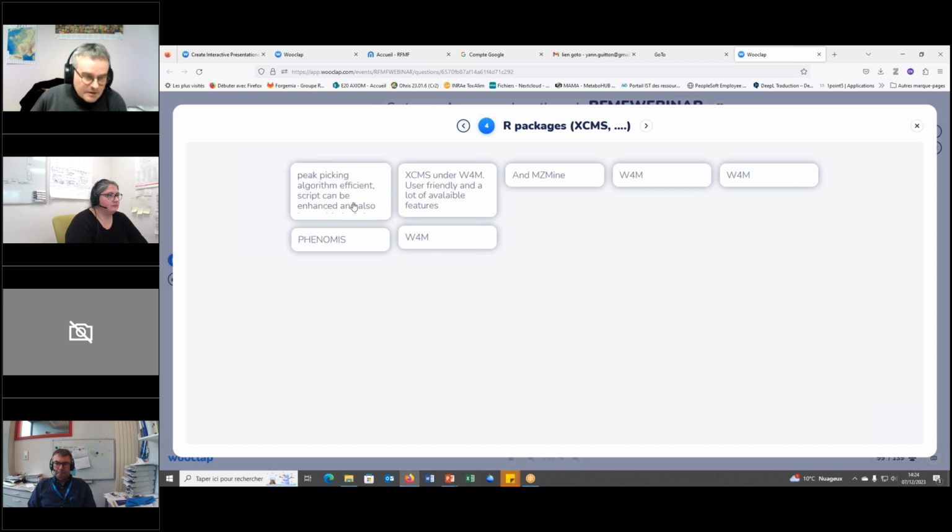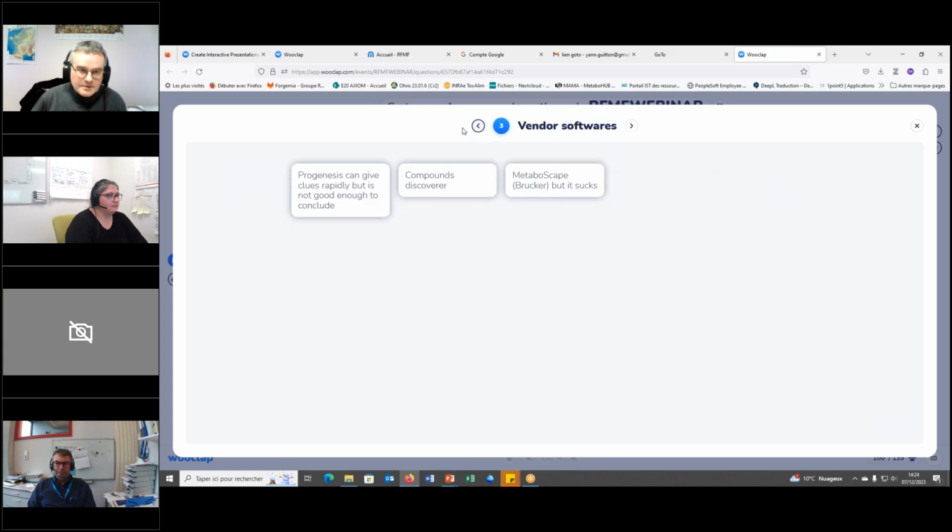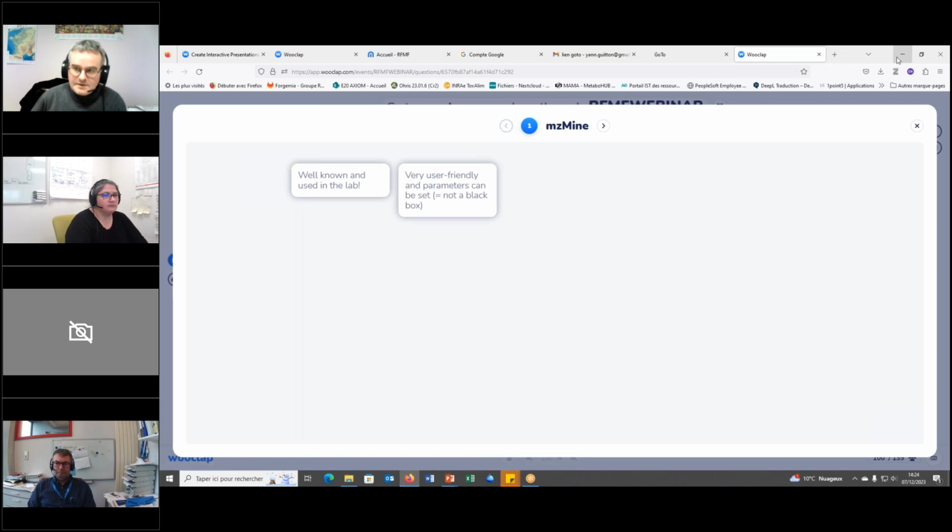Okay, I don't know. Scripts, okay. That's a good thing. Progenesis QI for the vendors, Compound Discoverer, MetaboScape, depending on it, yes, MS-DIAL because user friendly. Okay, well known, perfect, great.